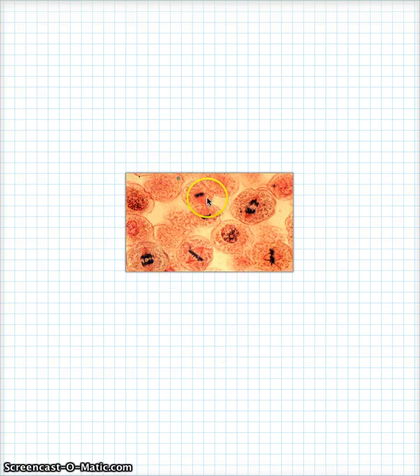All right, these are animal cells. Animal cells because they don't have a cell wall. Check this guy out. This is anaphase. Here's a prophase. Somebody might argue with me about that. I think it's prophase because the dark-colored chromosomes stain when they're formed as chromosomes and not as chromatin. I think this is interphase, for example.